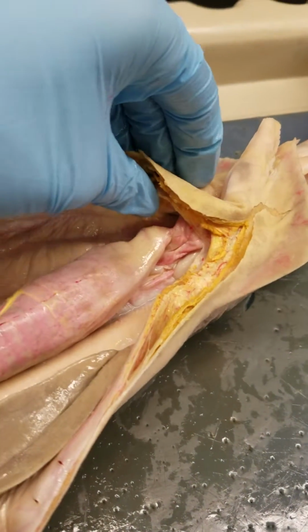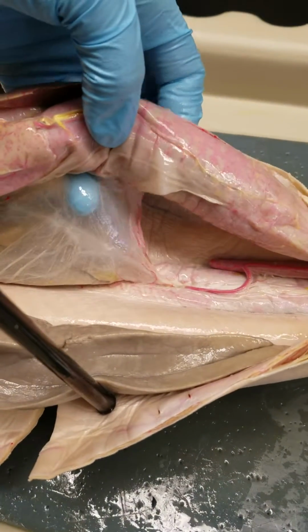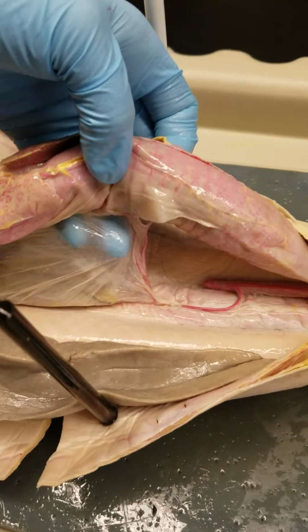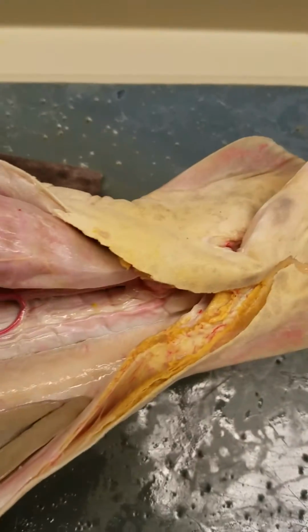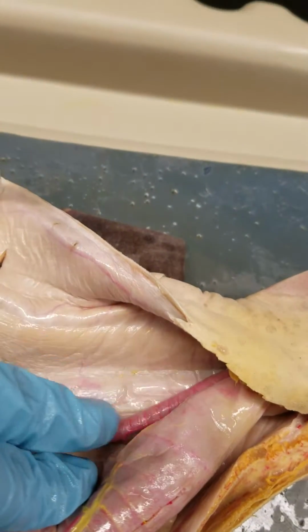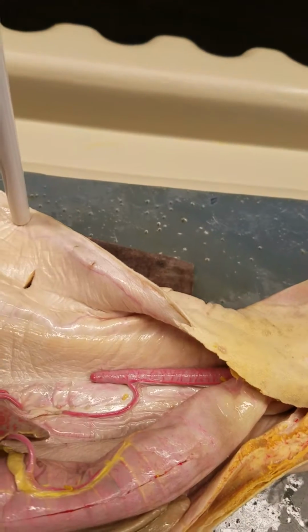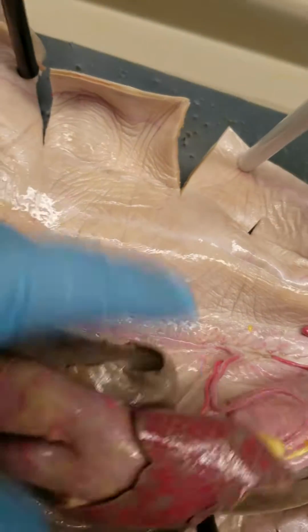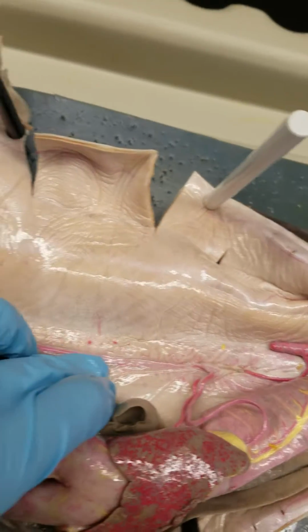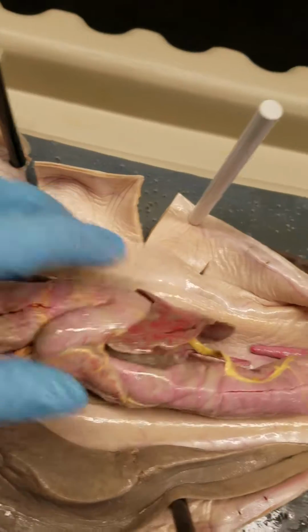So then, also moving down the intestine, you got your colon down here. So this mesentery is also your mesorectum, I believe. I could be wrong. So then if you move this aside, you can see your digitiform gland here. Then kind of moving everything away from this dorsal surface, you got your dorsal aorta here along that side.